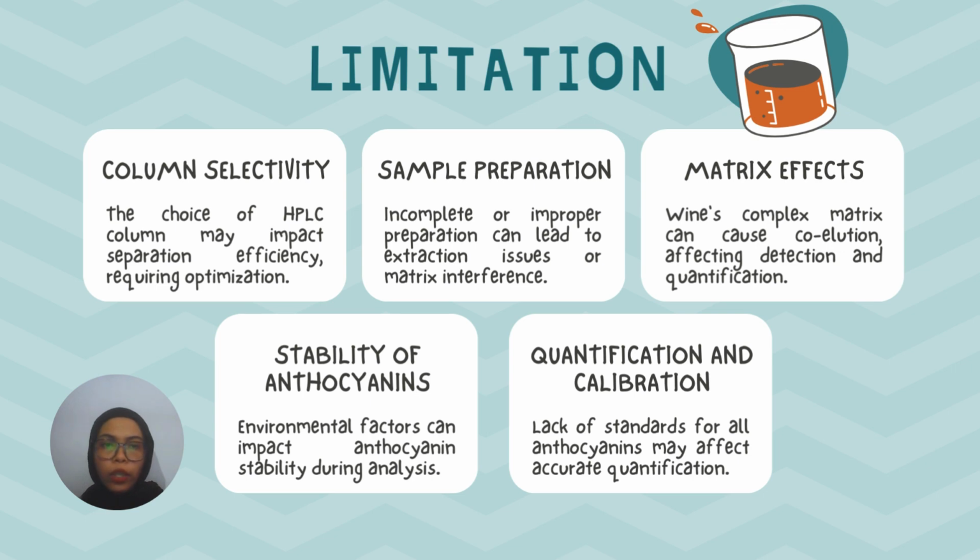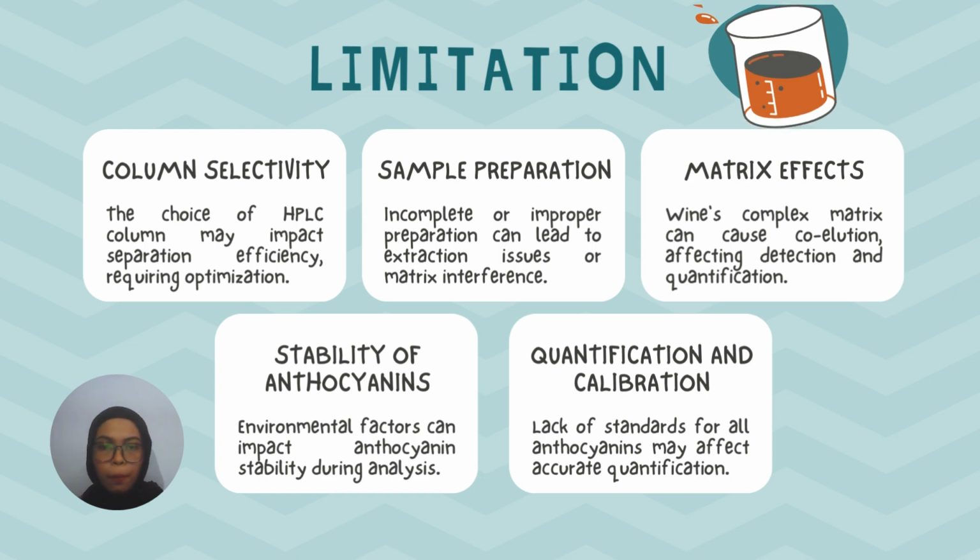Number three is matrix effects. Complex matrices can cause co-elution, affecting detection and also quantification. Number four is stability of anthocyanins. Environmental factors can impact anthocyanin stability during analysis. Number five is quantification and calibration. Lack of standards for all anthocyanins may affect accurate quantification.